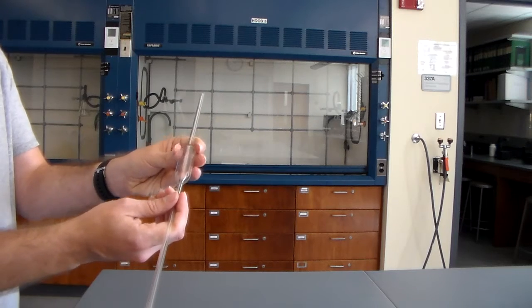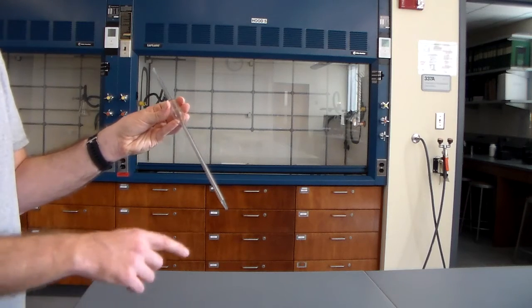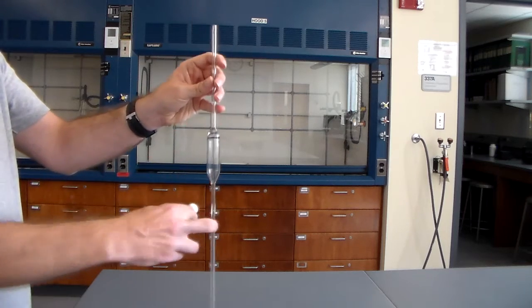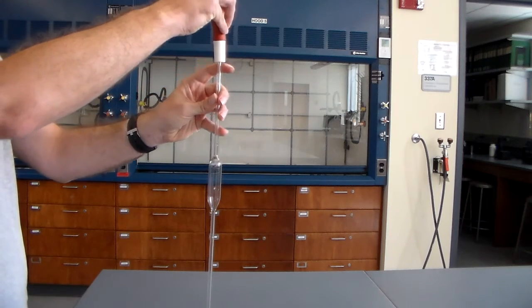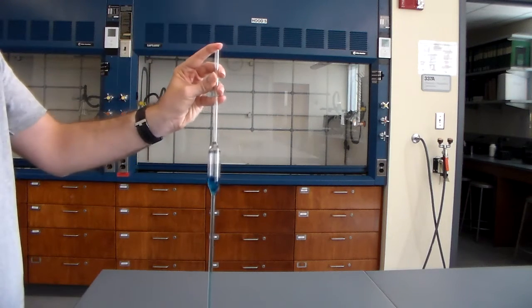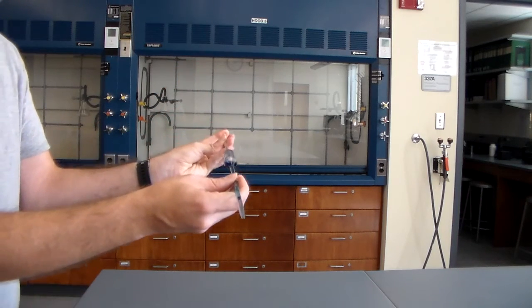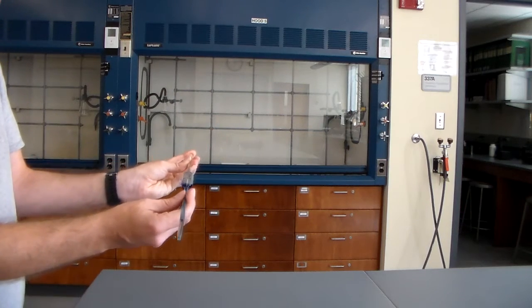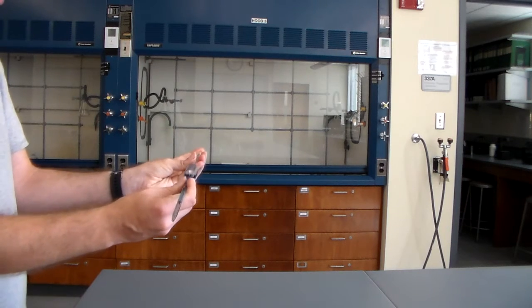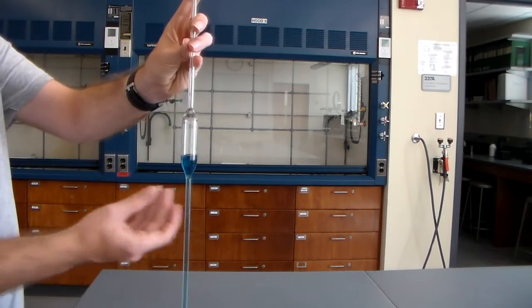Now after you've rinsed your pipette with water, you also want to rinse it with the solution that you're going to be using to avoid any dilution of the solution from residual water left in the pipette. So you only have to, again, fill this up about halfway. So right there is about good. We want to try minimizing the waste that we actually have. And then at this point, again, this is going to be over your waste beaker. Just swirl this around so this way it kind of coats the interior surfaces and any water that was in there gets rinsed away. And once you're happy with that, just let it drain into your waste container.